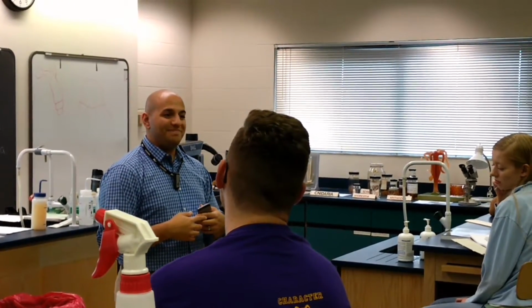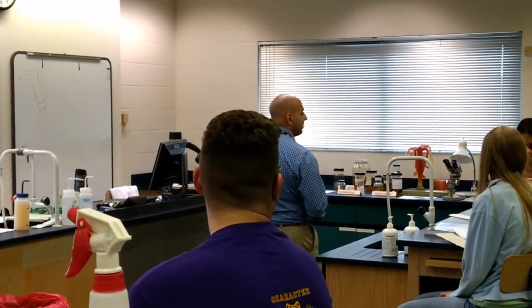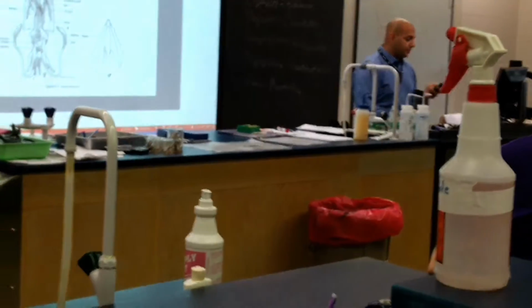Polyplacophora. Yeah, so they had this. Polyplacophora. You have an example of them right over here. Okay, so I want you to be familiar with your mollusk classes.